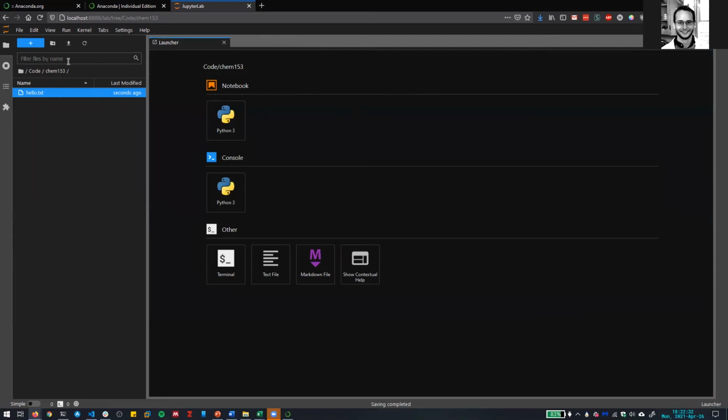So is anybody at this stage yet where they've got a Jupyter Lab or a Jupyter Notebook open and some directory made? Richard's already there. You already had it installed beforehand, though, so no worries if you're still catching up, that's fine. Anybody running into problems installing packages or anything like that?